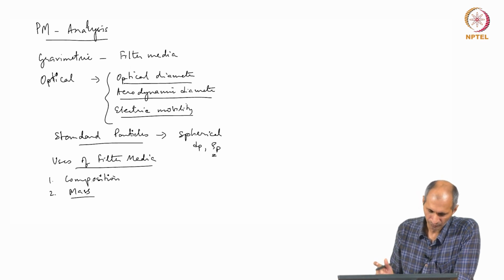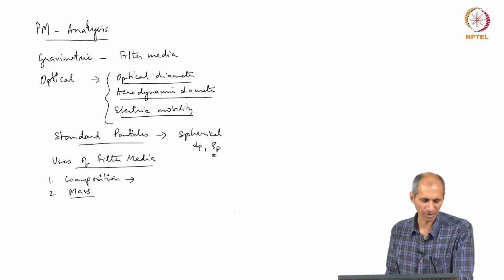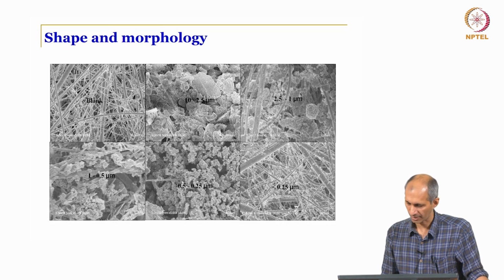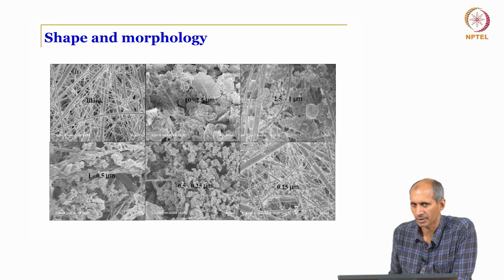So composition of filter media is a very important thing. You would like to see what these particles are. One of the ways in which we do that is by looking at composition, shape and morphology. You can look at shape and morphology by using microscopy.